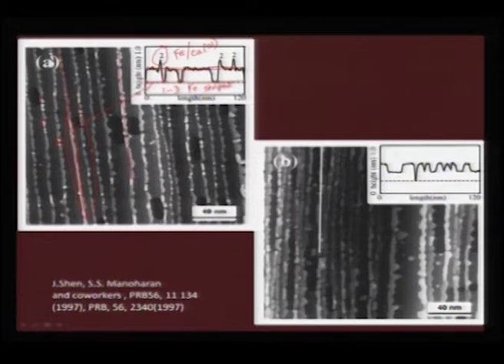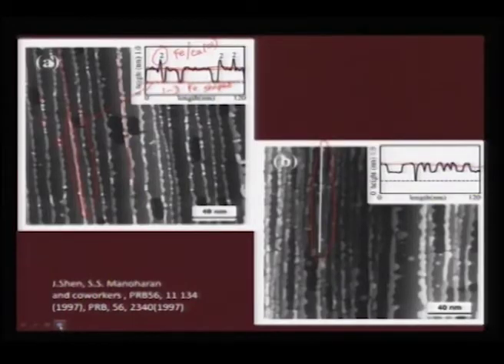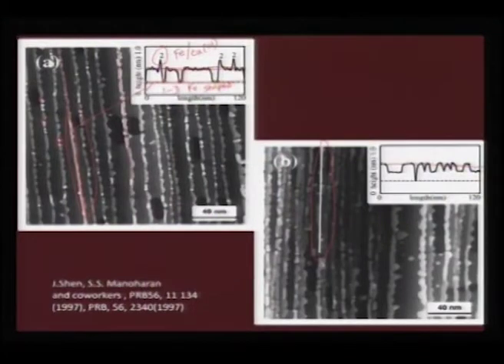Now, if you improve little bit more on the thickness, then you can see that this is only a continuous layer, second layer growing. So, all this information that you can get out of a line scan from a post calibration that you can do while saving these images. Now, the same example we can take, but we can try to deposit the iron layers instead of using a thermal deposition technique where you get this sort of one dimensional stripes.